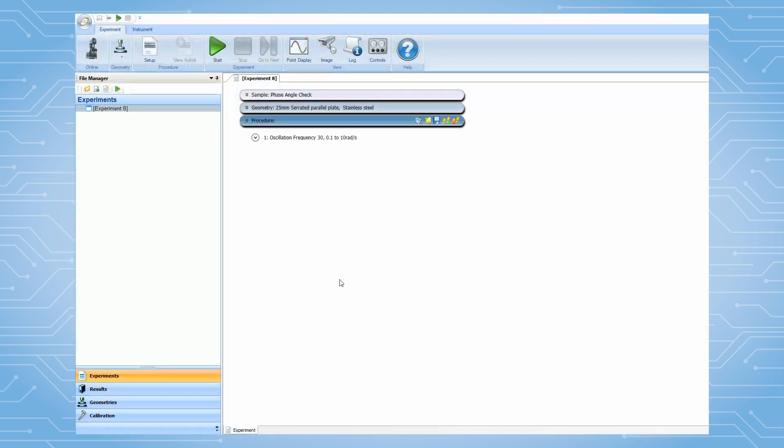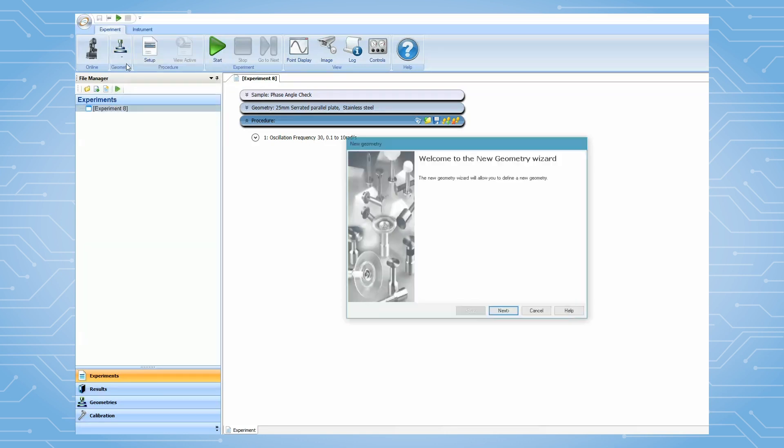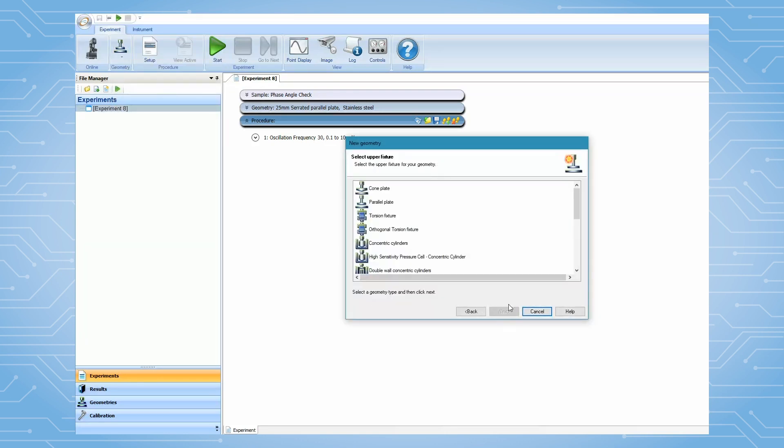If this geometry file has not been previously created, then click on Add New Geometry. Choose three-point bending from the list, then click on Next.